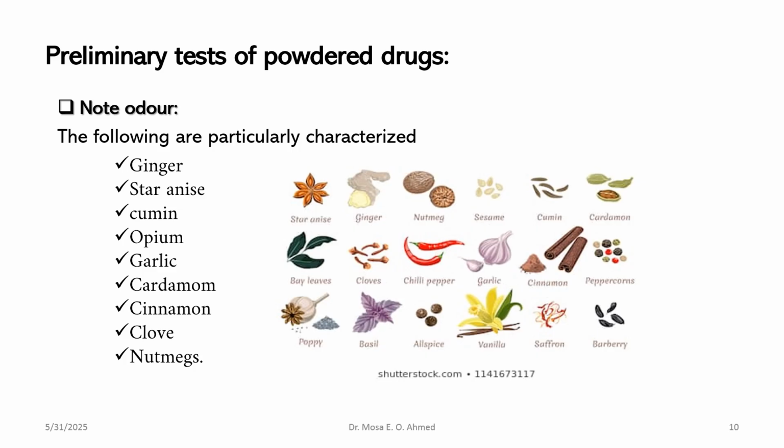Also, another important preliminary test for powdered drugs is their odor, whether they have an odor or not. There are some examples of powdered drugs having a characteristic odor. We know this by going to the reference material or the reference for these natural drugs.